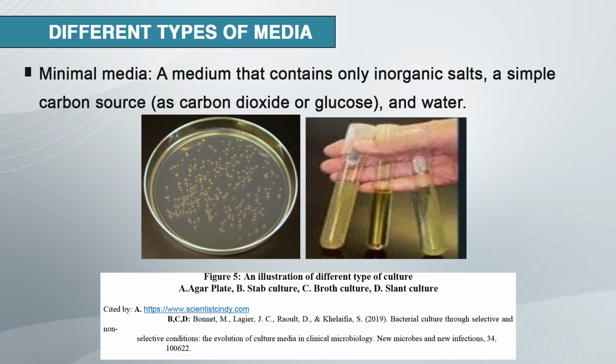Assay media is used for antibiotic assay. Minimal media is a media that contains only inorganic salt, a simple carbon source, etc. Now, minimal media is the media which contains very little amount of a specific nutrient. This is the figure showing agar plate, stab culture, broth culture, slant culture, etc.